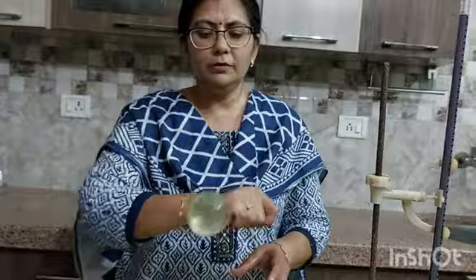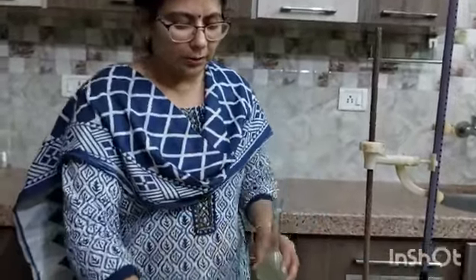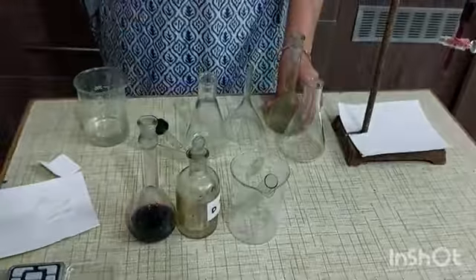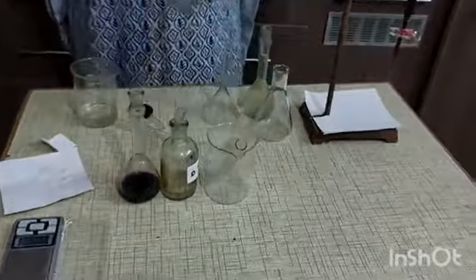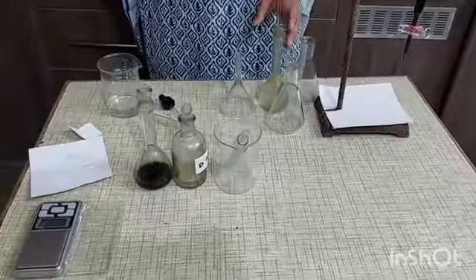Shake it well and take out 10 ml of this known ferrous ammonium sulfate from the pipette.